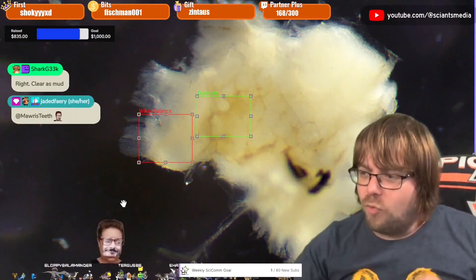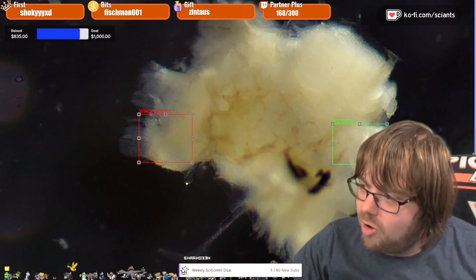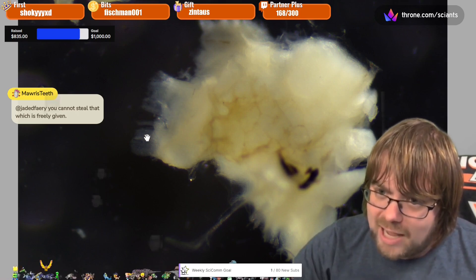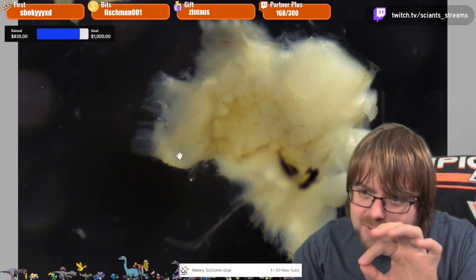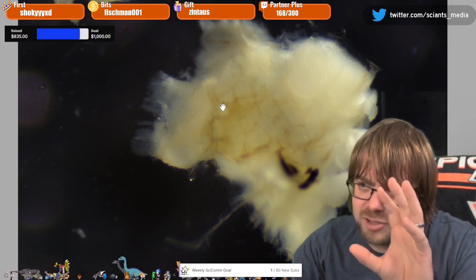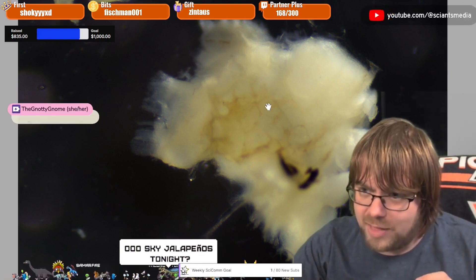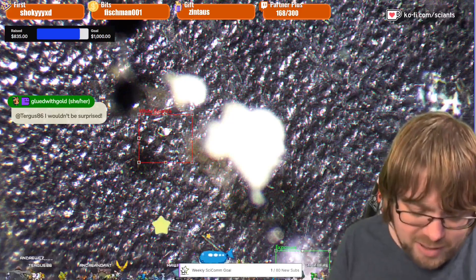Right here is the eye. We're at max zoom - 45 times magnified. All those little lines are individual neurons that connect to each of those circles on the outside of the wasp's head. Each of those omatidium - plural omatidium - had a neuron connected to it that relays individual information into the optic lobe of the brain. A little bit deeper is the lobula, where visual information is processed together. All those images are unstitched at this point - just independent signals - and in the lobula they're stitched together to make one giant image that then goes deeper into the brain.